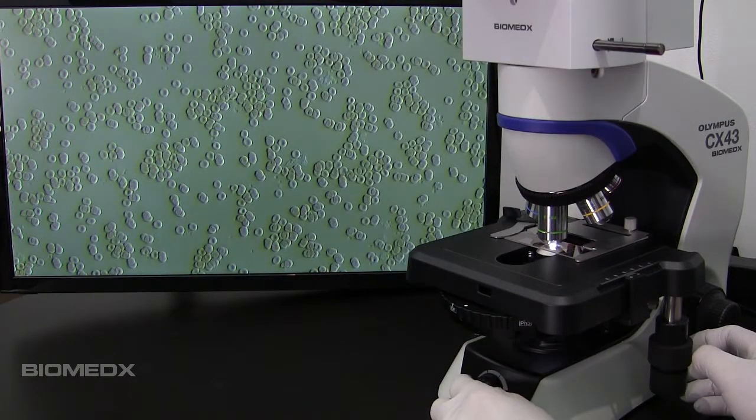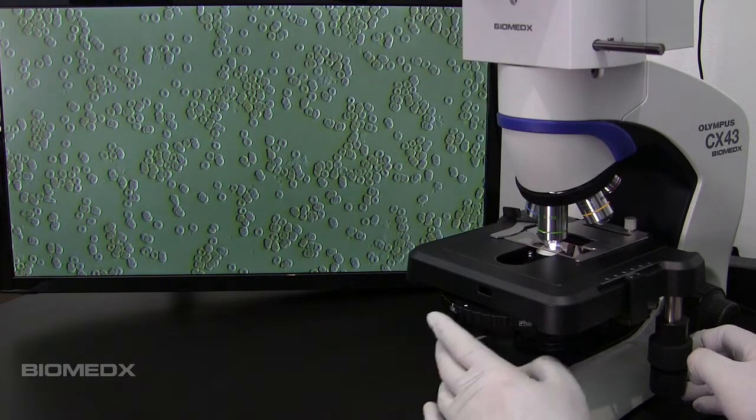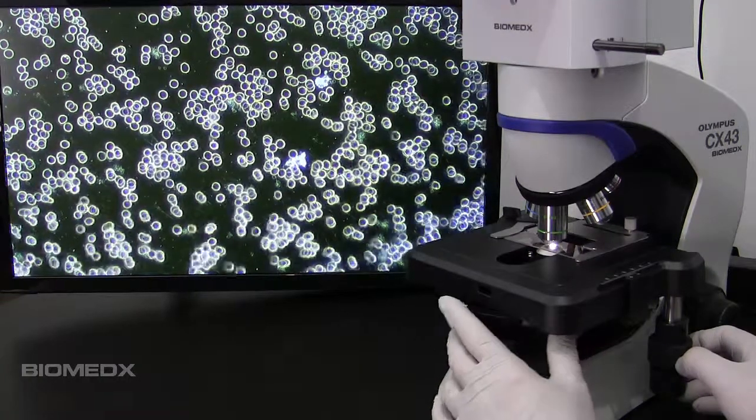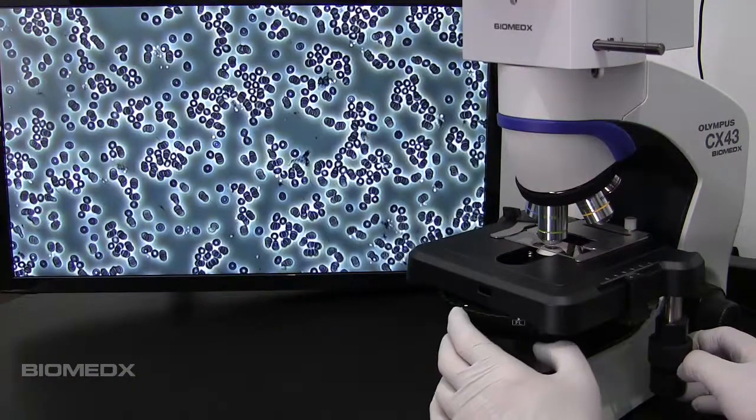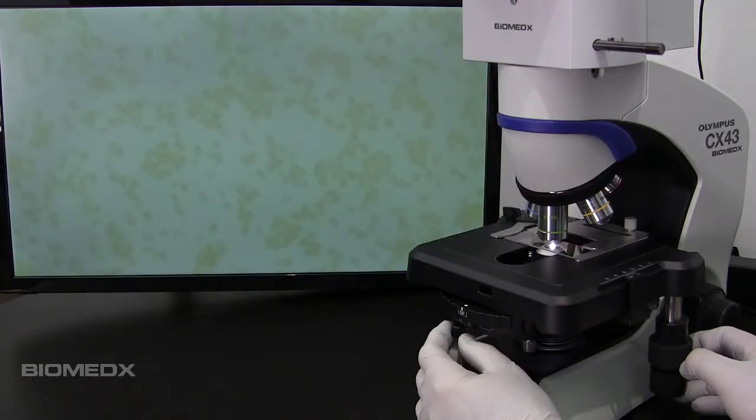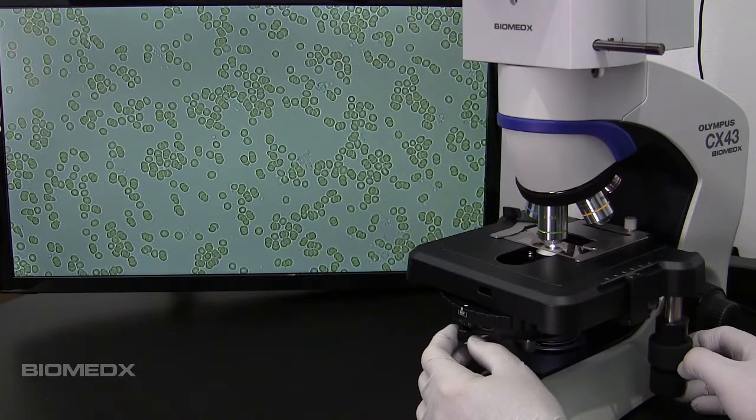You might have noticed how easily we can flip from one mode of lighting to another mode of lighting. One thing about these systems is the smoothness of operation that you just don't find with so many other scopes, especially a lot of the Chinese imports which have flooded our market and are sold under a lot of different brand names.